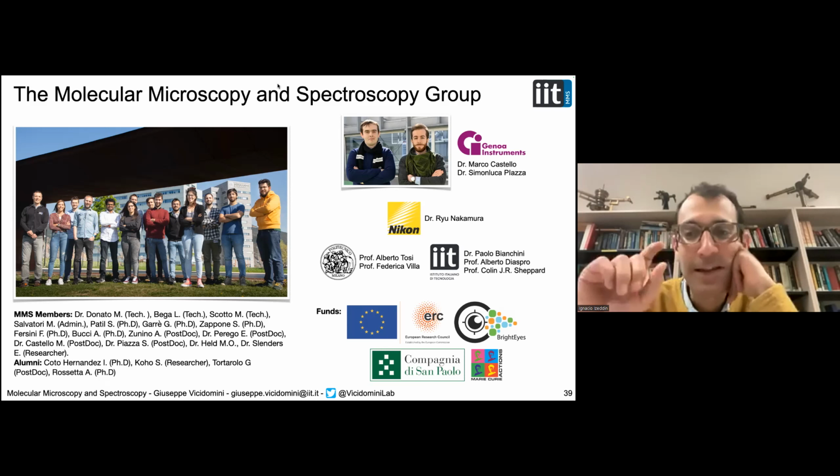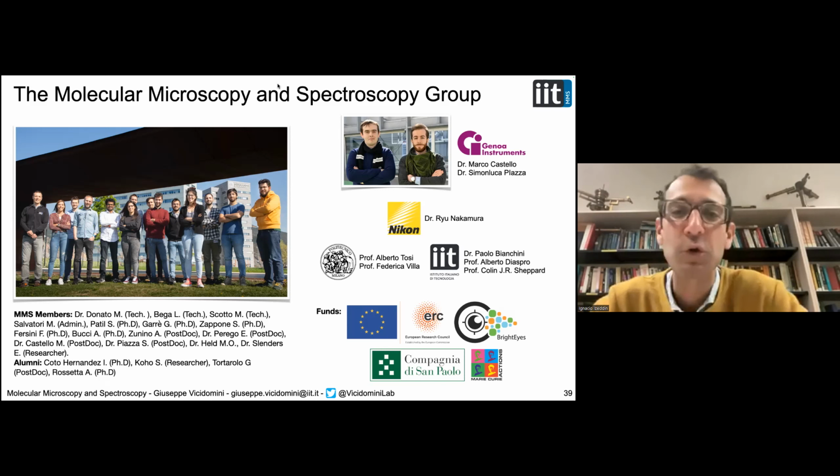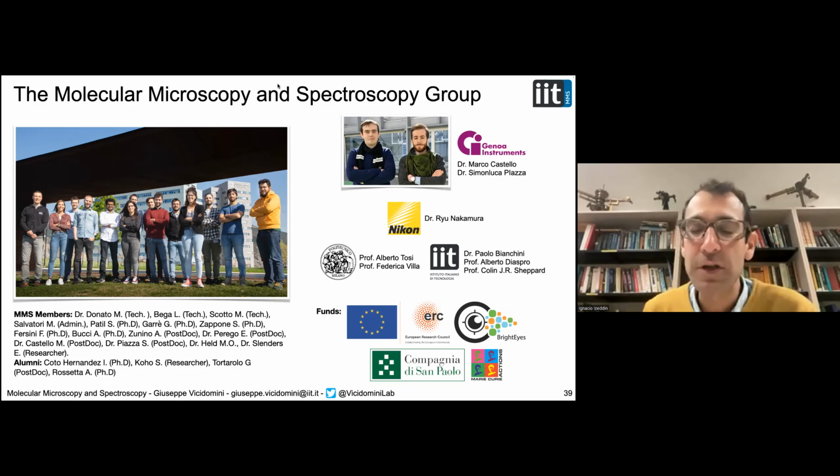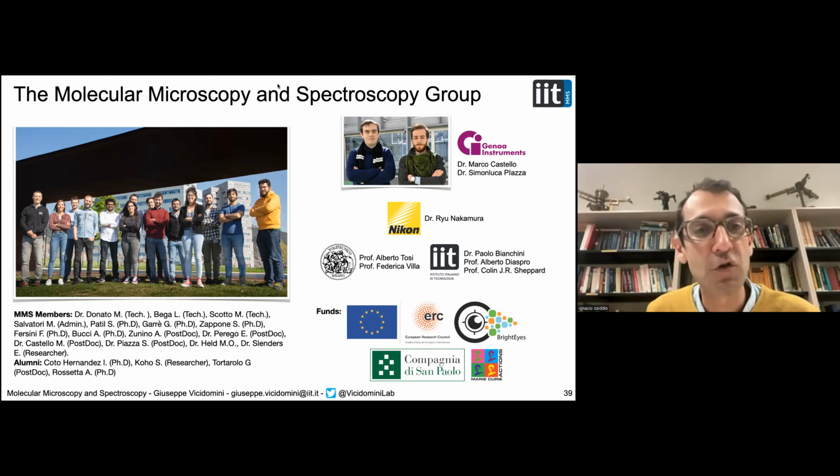Okay, and I just have a technical question also for Sabrina, and after that, if there are no more questions in the chat, I will give the word to Virginie to close the session. So I just wanted to know, it's an asynchronous scanning, so what is the frequency of scan, if you have that in mind? And if I understand correctly, there is no synchronization to be performed, right? So the mirror is scanning freely, and there is no synchronization with any other element of the system? Or am I seeing that wrongly?